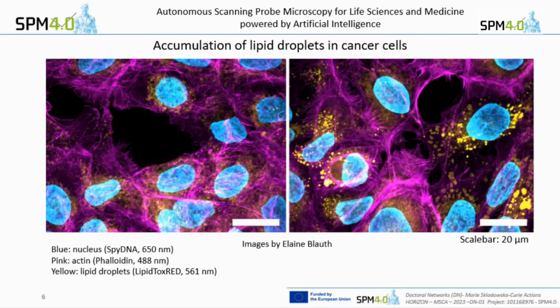which is also a supporting structure in the cell. And I also wrote down the stains she used here. And you probably noticed that these wavelengths do not match the colors you see. So most of these fluorescence images you see in papers are usually colored. Here, two of the stains are in the red, in the, let's say, normal red and the dark red. Basically, as Anja mentioned before, the longer the wavelength, the further we can go in, the less energy we need, which is less damaging for samples.